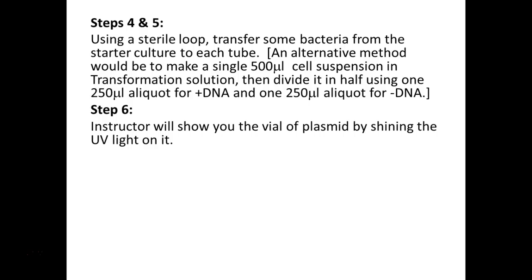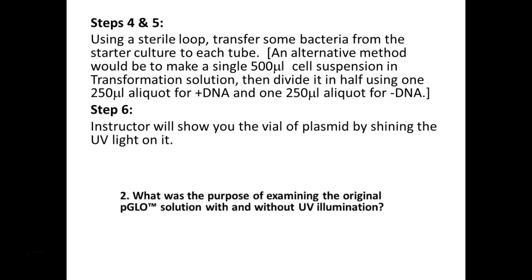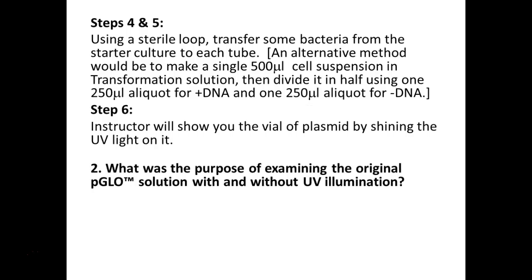Then I'm going to come around with the plasmid. I'm going to shine UV light on this plasmid. Why am I doing that? Check if it works. No? Because what is going to fluoresce if I shine UV light on it? What are the bacteria going to make? Green fluorescent protein, right? Are we giving them the protein, though?